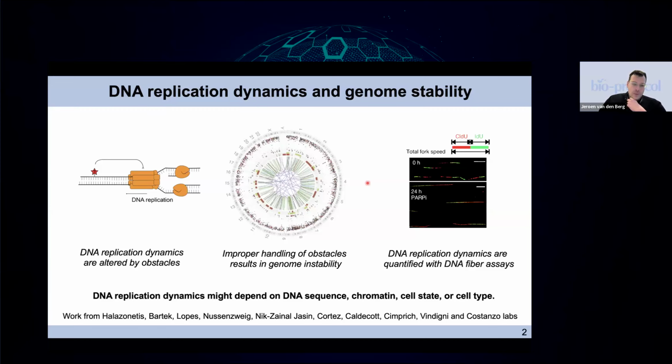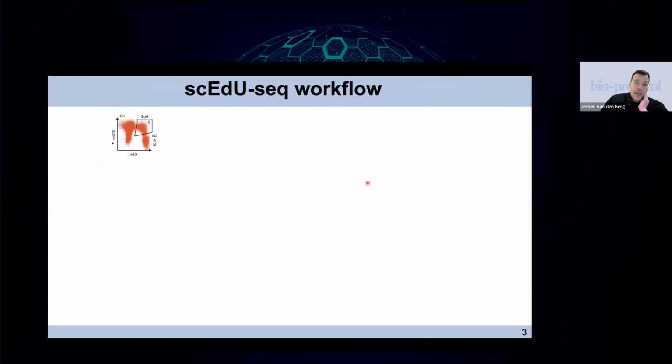So in order to address that, we wanted to develop a method with which we could probe all these different things in combination with these DNA replication dynamics. I'll shortly start with a workflow, and then I'll keep on going to more of the analysis.